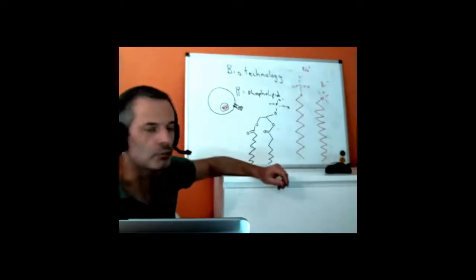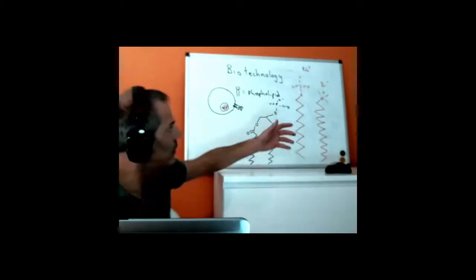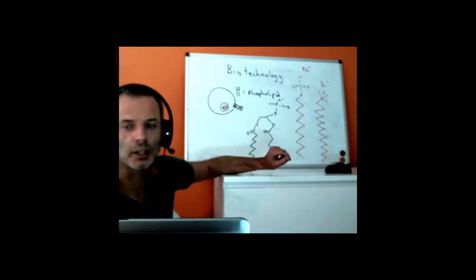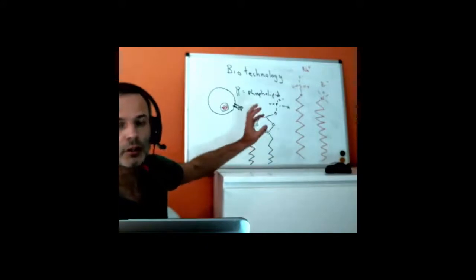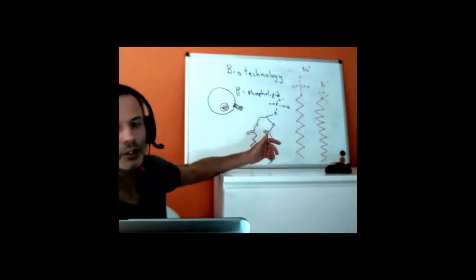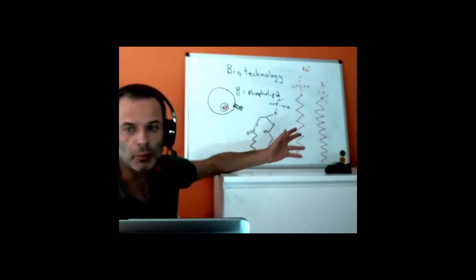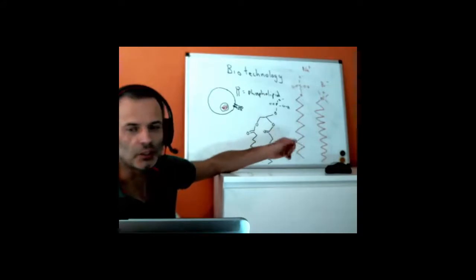The counterion in this case is bromide, and this is commonly known by the name CTAB, cetyl trimethyl ammonium bromide. It's particularly interesting at the moment because it's an antibacterial, antiviral agent, because we discover that most cell wall components, including sugars, including bacteria, including viruses, most of them are negatively charged, and that means a positively charged soap is actually better at messing with them. It's also better at messing with us, so it damages our skin.